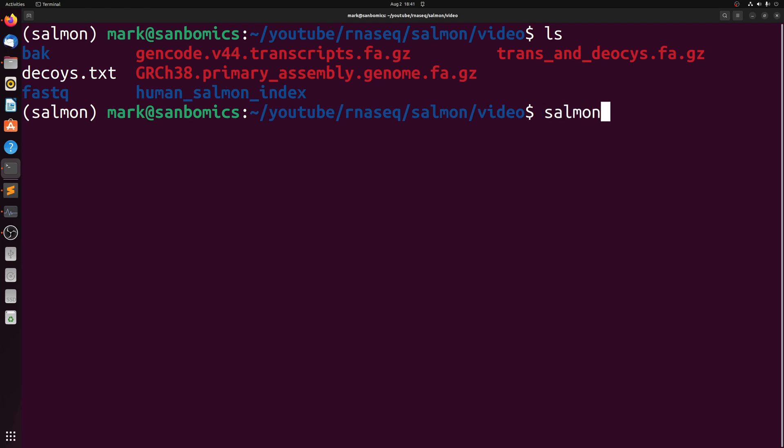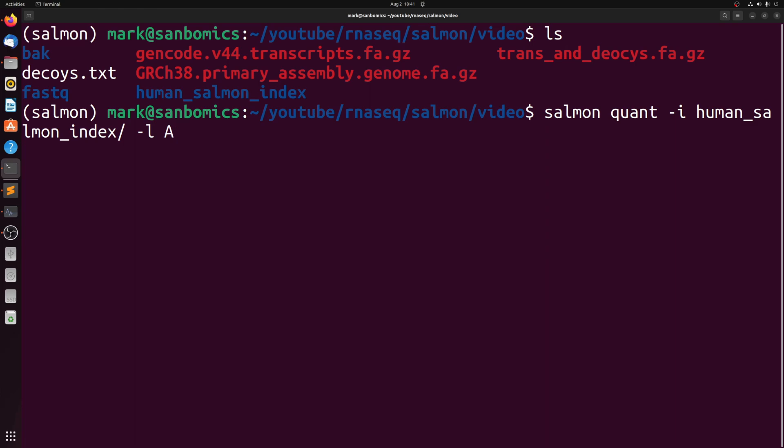So we're going to do salmon quant. We're going to pass dash I to our index directory, human salmon index, and then we're going to do dash L and the dash L is for our library type. And A stands for automatic, and that will tell salmon to figure out your library type automatically, which is usually the easiest way to do this.